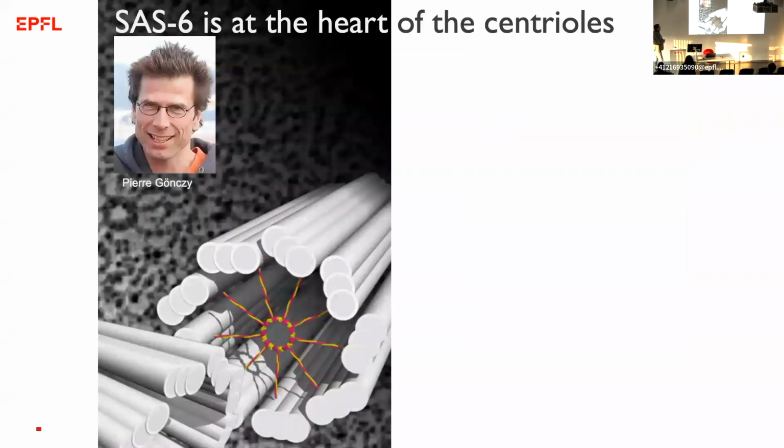Here's just something that we can do with it. So after we built these microscopes, it's not enough to just look at calibration samples. We want to have something that actually people are interested in. This is a nice thing here. Both Aleksandra and I, we are in the Institute of Bioengineering, which spans the School of Engineering and the School of Life Science. So we have access to a lot of interesting colleagues, a lot of interesting samples.